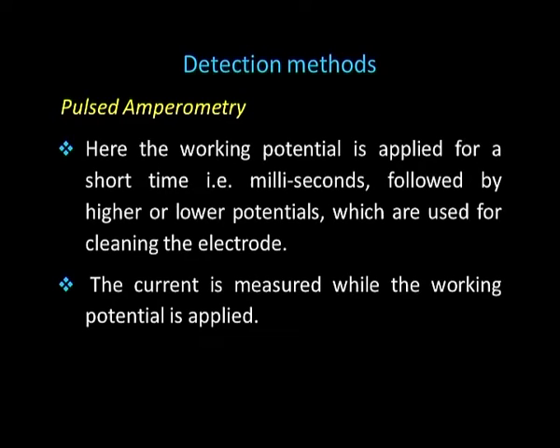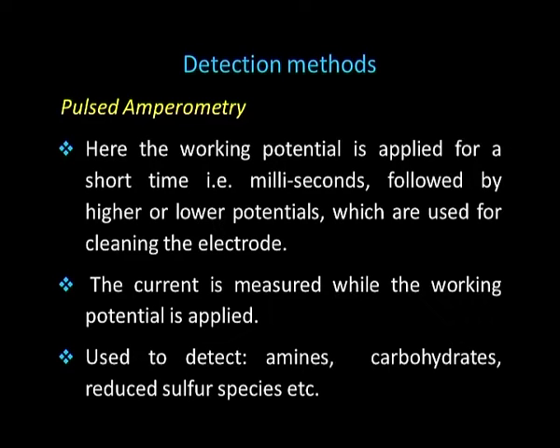The current is measured while the working potential is applied, and the technique is used to detect amines, carbohydrates, reduced sulfur species, etc.